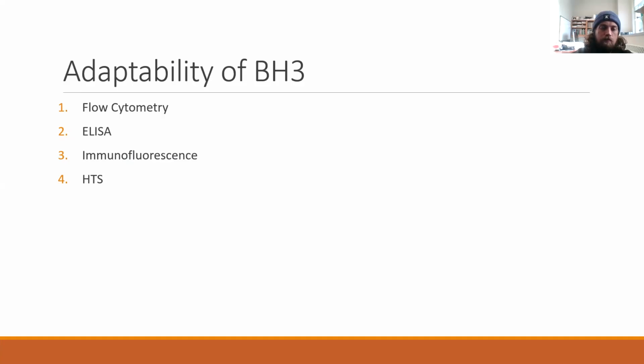So to summarize BH3 and its adaptability, we use it as a flow cytometry technique, but it actually began as an ELISA technique, and it's currently being adapted into immunofluorescence as well as other high throughput screens and high throughput protocols for drug analysis.